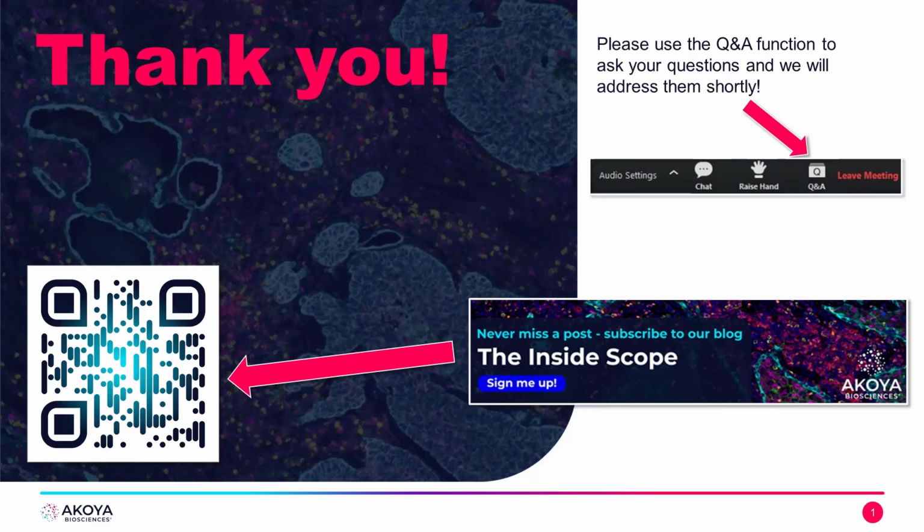Can I use the SIM in my own microscope computer? I have an Axio Scan from Zeiss. Its core microscope is an Axio Observer. SIM installation usually will depend on a case-by-case basis. We do have some basic parameters that we include whenever we are talking to potential Codex users, and we provide them that basic information, what our basic requirements are. So we might be able to run the SIM on your own computer, but it really will just depend on what the parameters are, and we can share that information with you after this webinar.